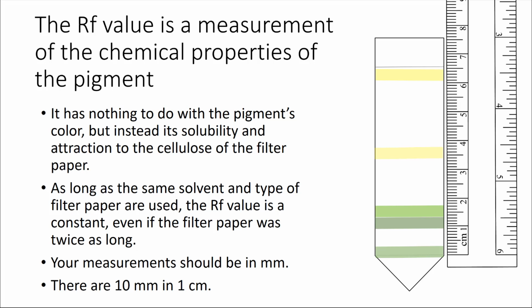For this lab activity, when you make your measurements, please make sure you are measuring using millimeters. And recall, there are 10 millimeters in 1 centimeter.